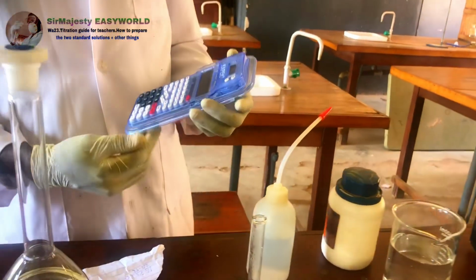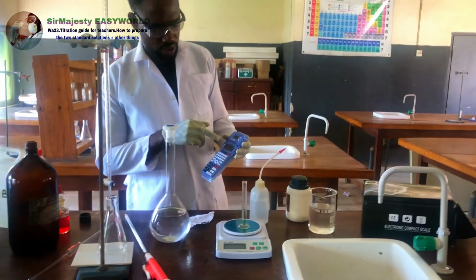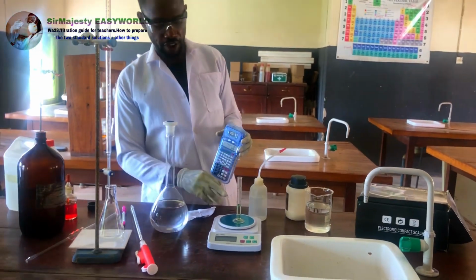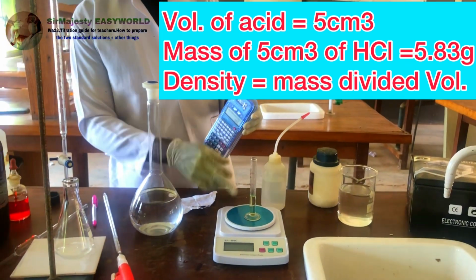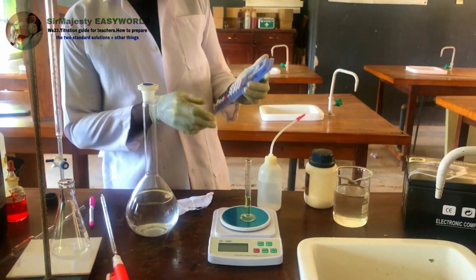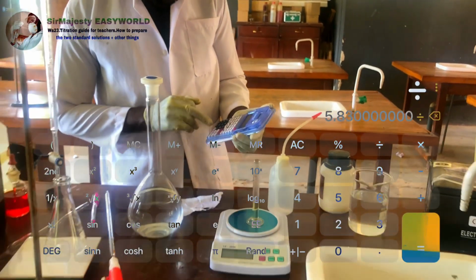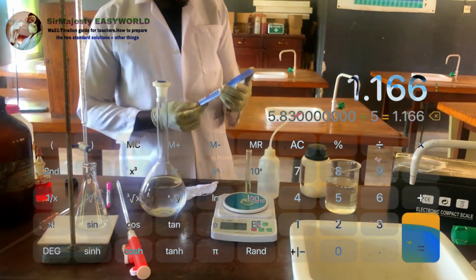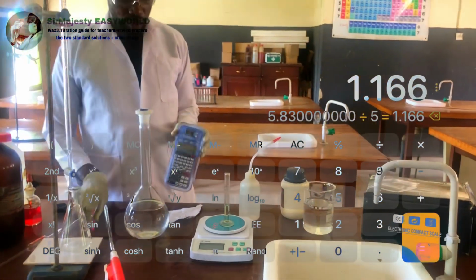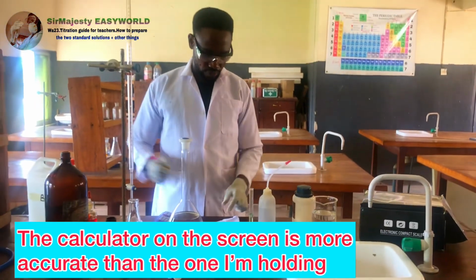Since density is equal to mass over volume, what will I do now? I'll just say 5.83 divided by 5 mil, because the volume is 5 and this is the mass of the acid. So the density will now be 5.83 divided by 5, which is 1.16. The density of this acid is 1.16.